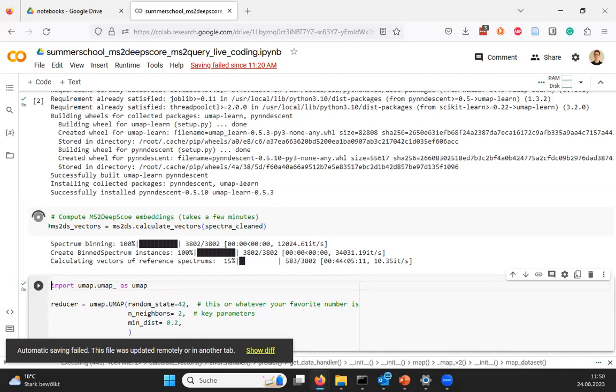So we can wait for this to finish. It's not super bad, but it will take a few minutes. In the meantime, I can take questions if there are any questions on the session so far. And we can also look at some trouble if there's trouble running this.